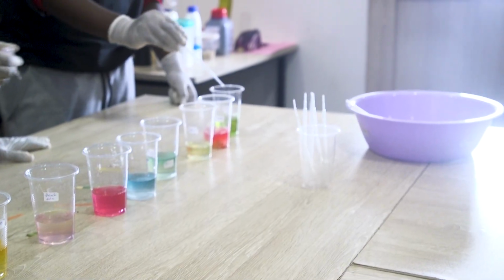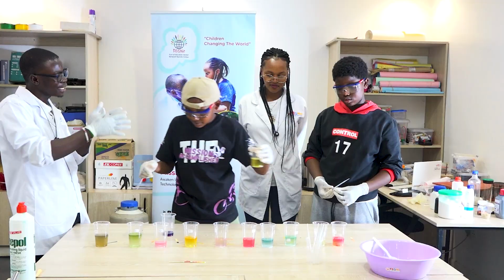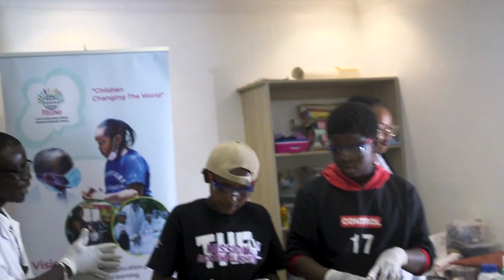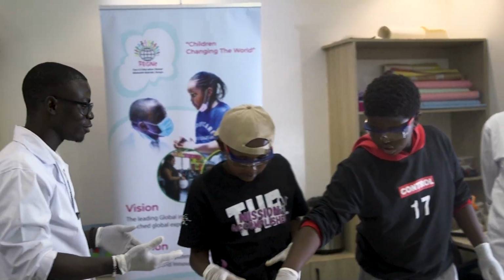Green. Good. So guys, we said if it's red, or anywhere in the shade of red, then it's an acid. And if it's green or blue, then it's on the base side, okay? So we can arrange them in the order of bases or acids.